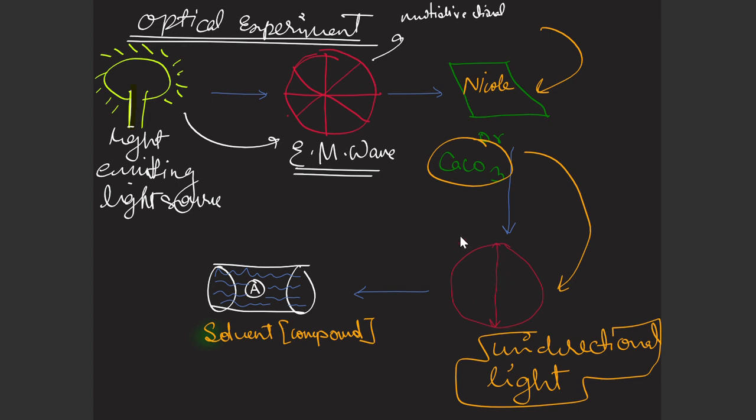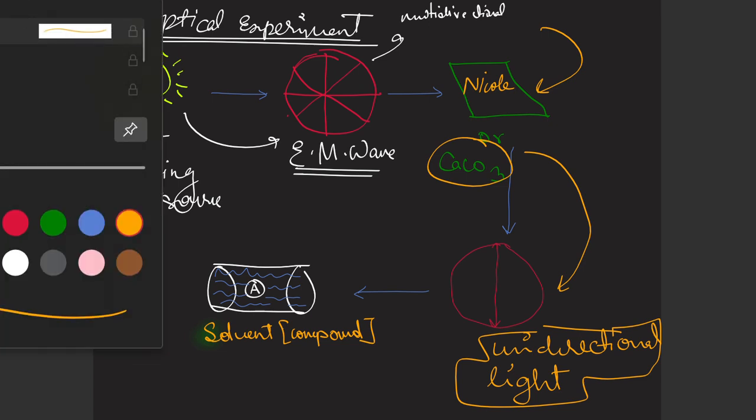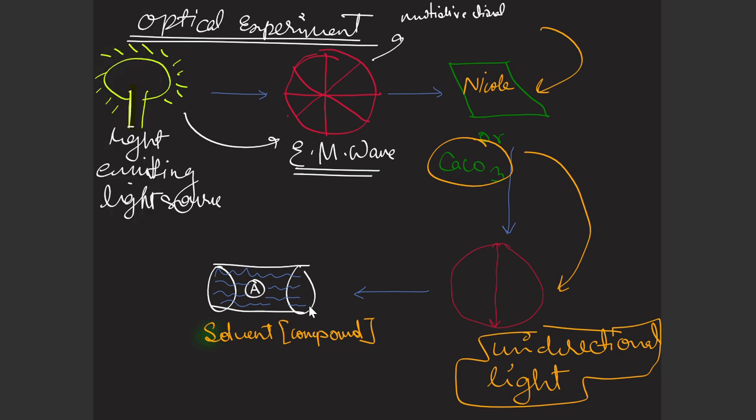It is easy for us to observe and to study. It is also called plane polarized light, PPL.